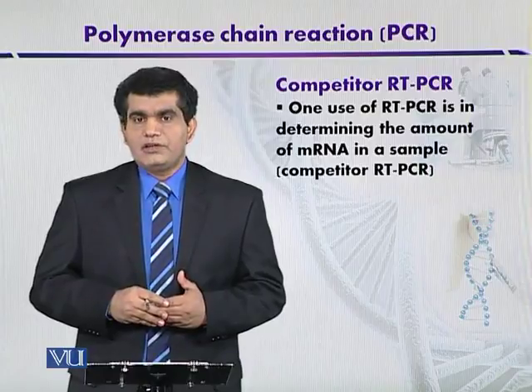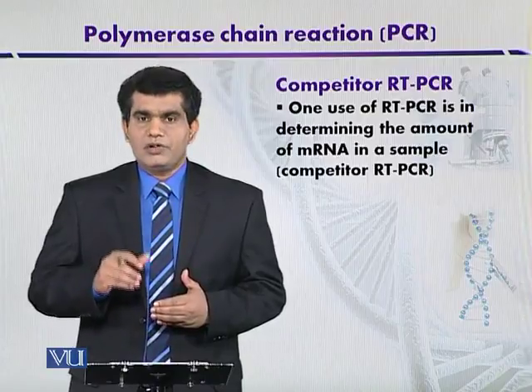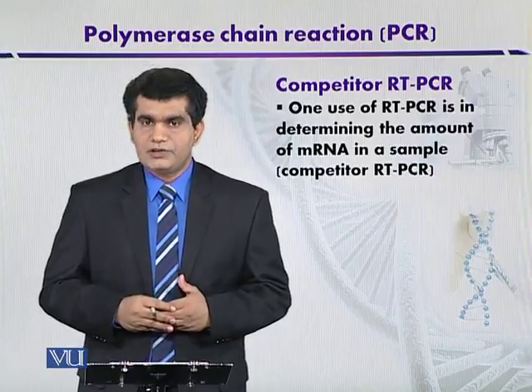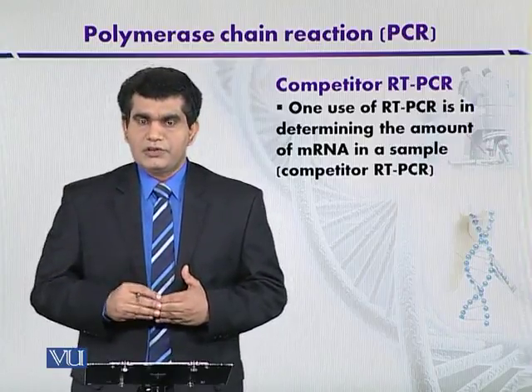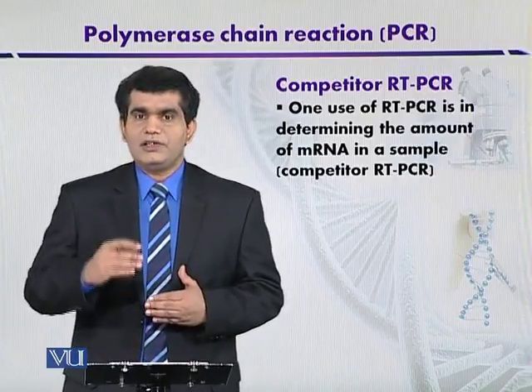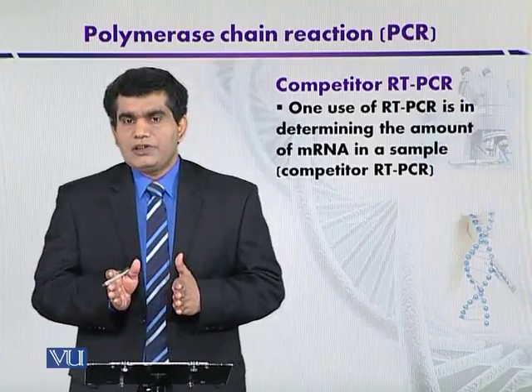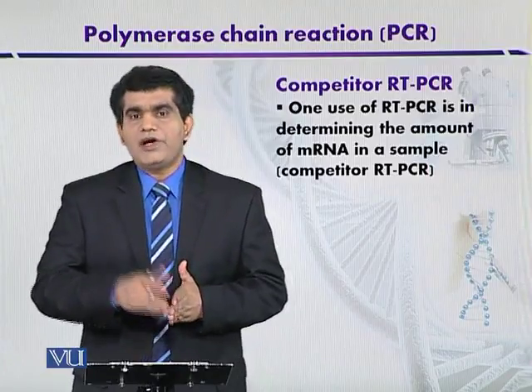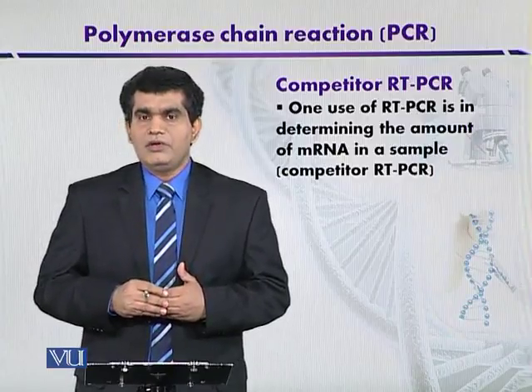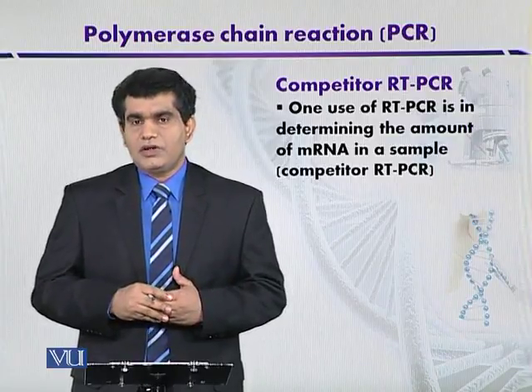Another application is that it can be used to quantify the RNA molecule, either from certain tissues or in certain PCR reactions. So during the extraction process, this synthetic fragment of RNA, which is competitor RNA, is added, and by calculating the ratio of the competitor RNA in comparison with the target RNA that we have extracted from the sample, we can determine the losses of the target RNA. So this is also one of the applications.